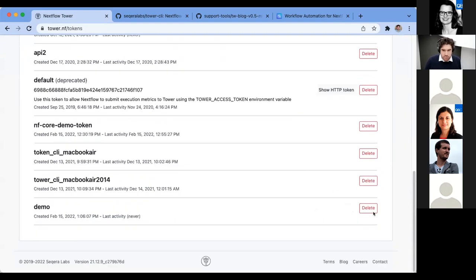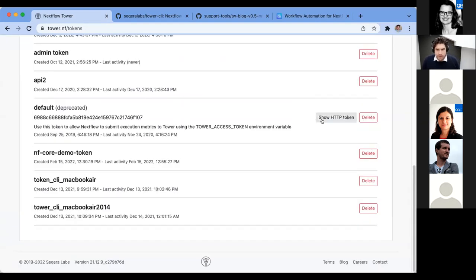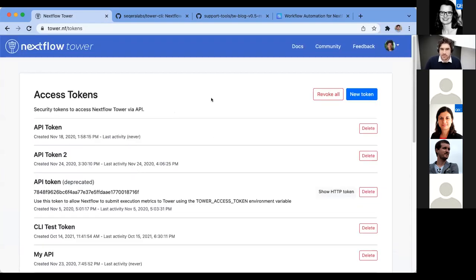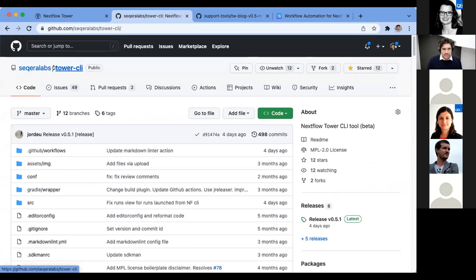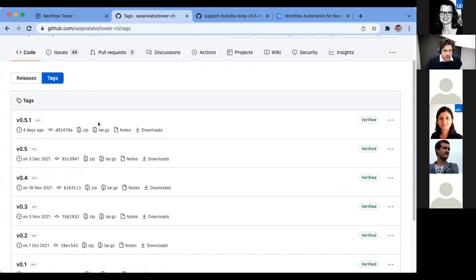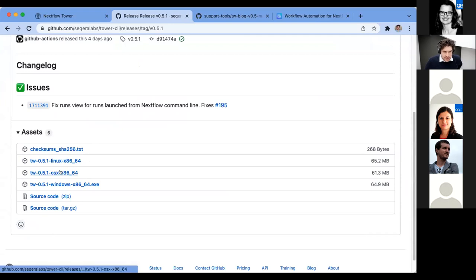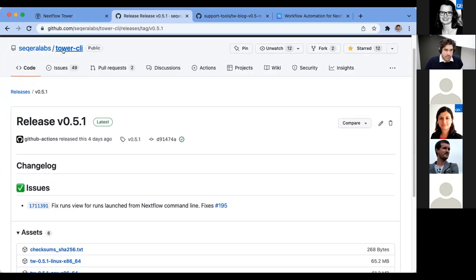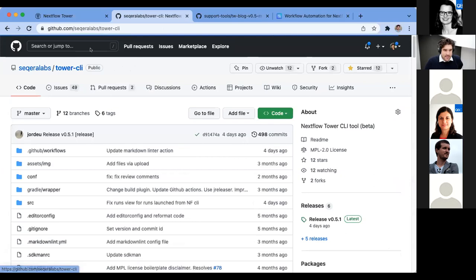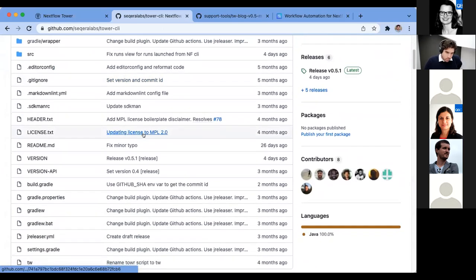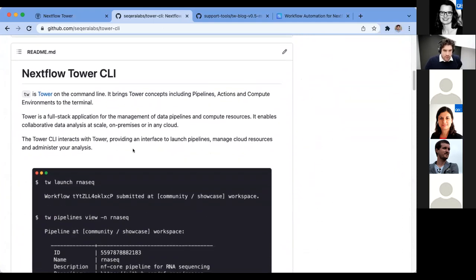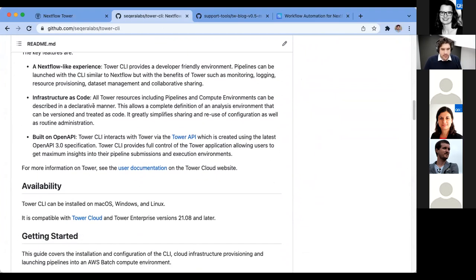The Tower CLI is a standalone open source piece of software which you can download from GitHub. We have built it for all different environments — Linux, OSX, and Windows as well. You can simply download that file, make it executable, and run it. I'm running a Mac today, so I've downloaded the latest Mac version into my terminal.